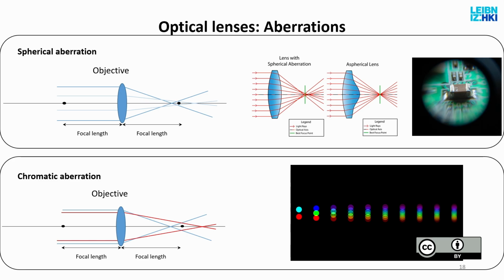Why is this? It is because the n, the refractive index that I told you about 12 minutes ago, which is the ratio of the sine functions, strongly depends on the material itself, but also strongly depends on the wavelength of the light. Exactly this way, so that the focal distance for short wavelengths is shorter than the focal distance for longer wavelengths. This is unavoidable.